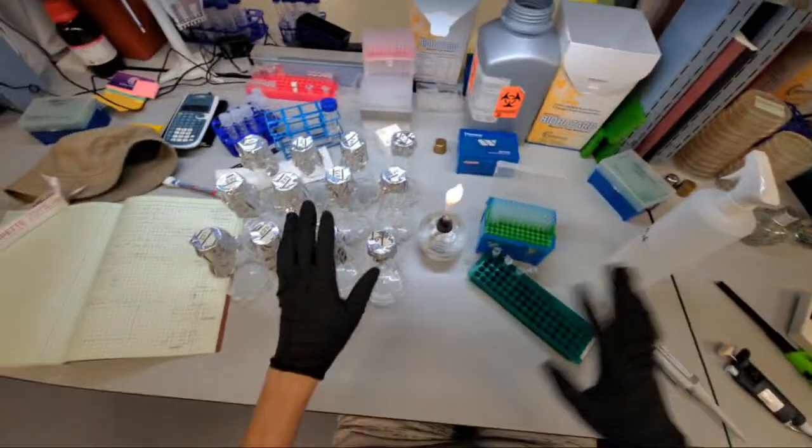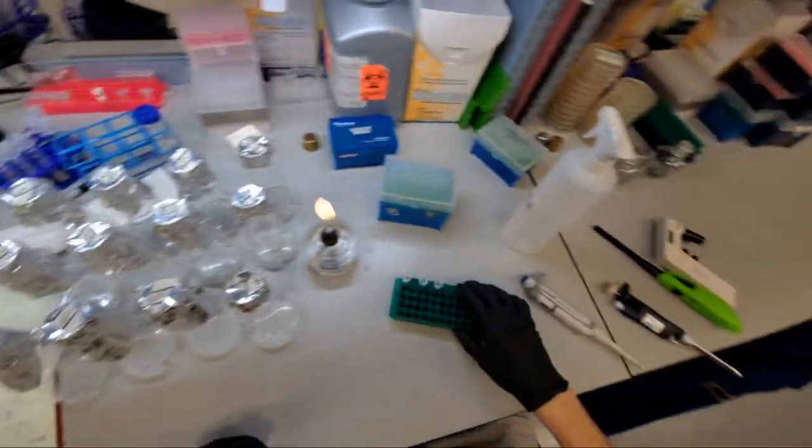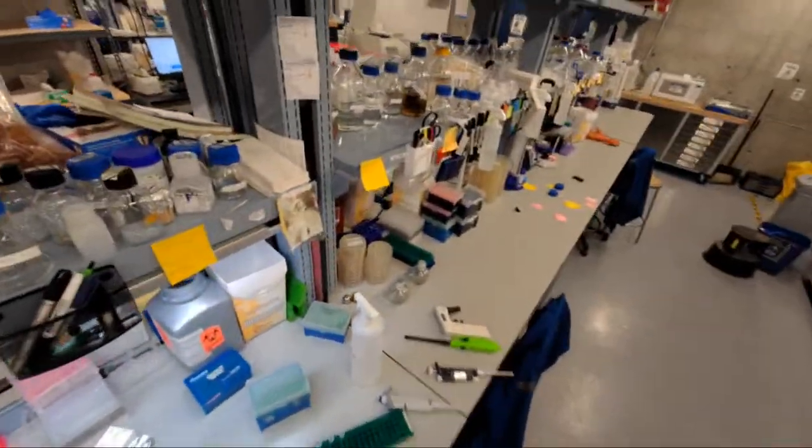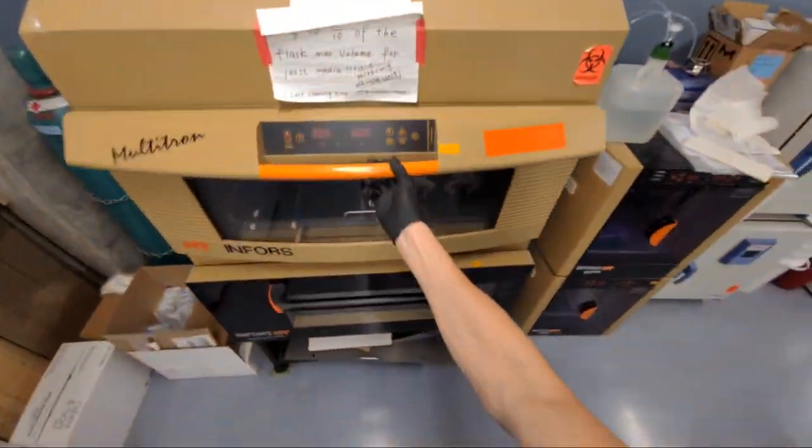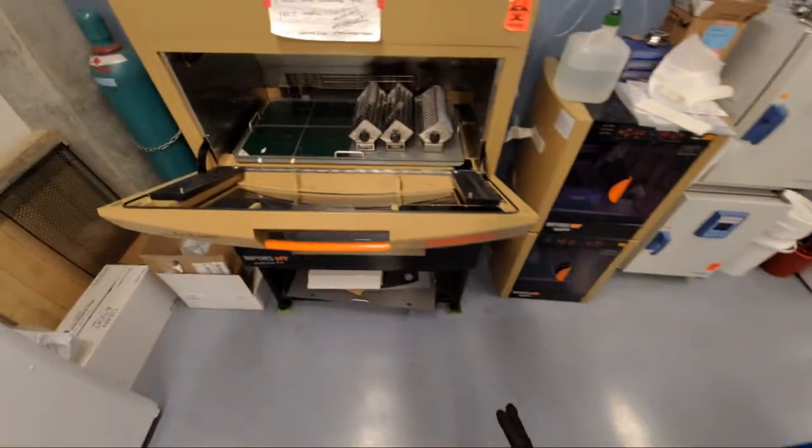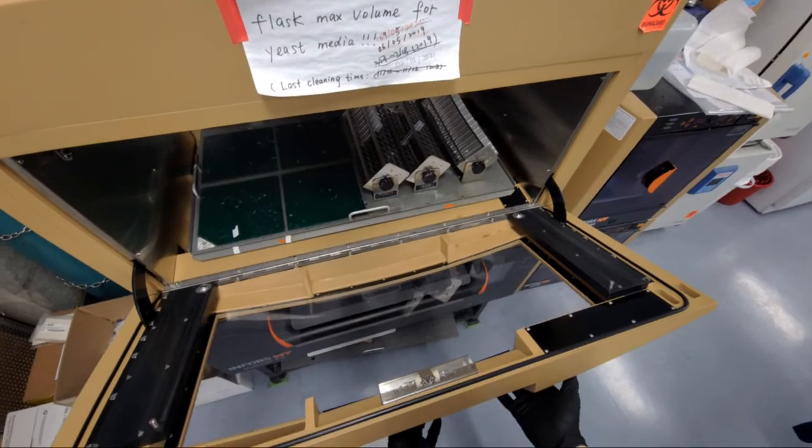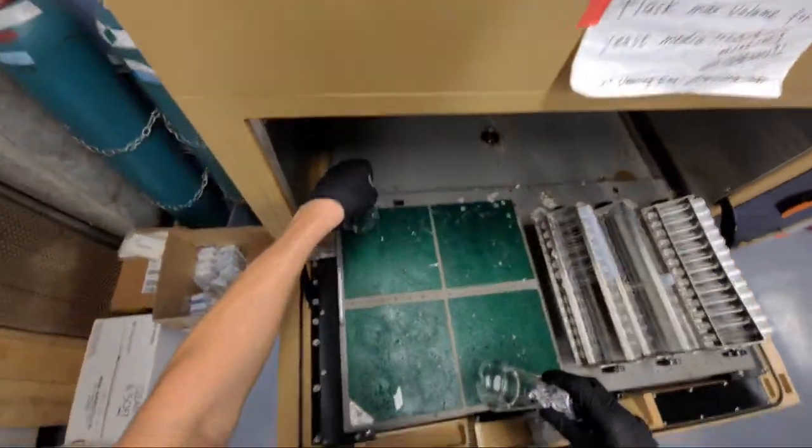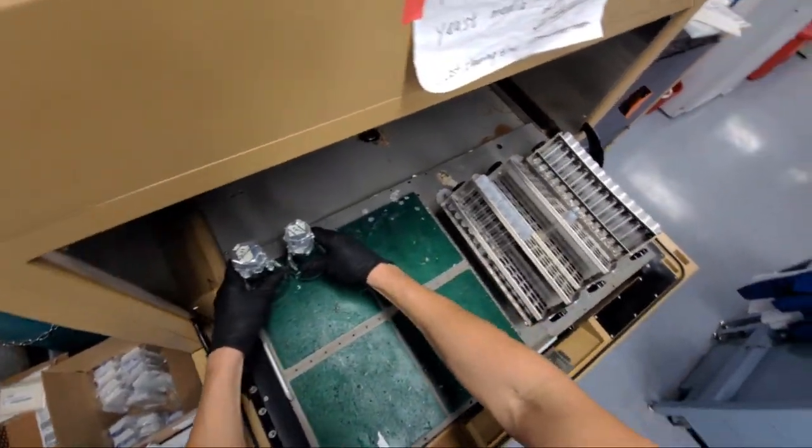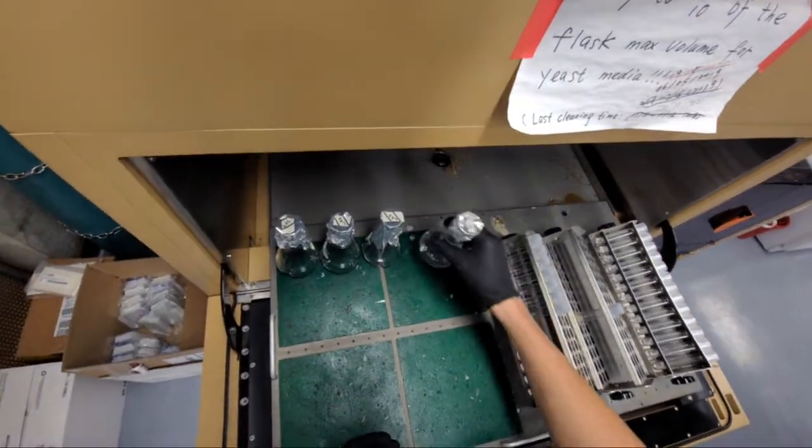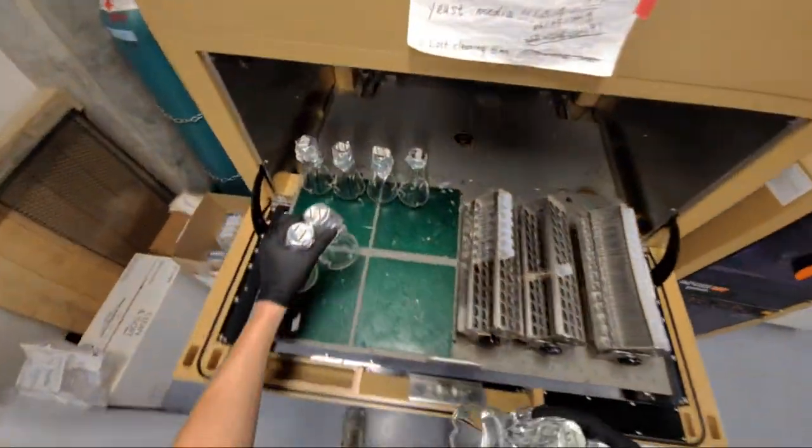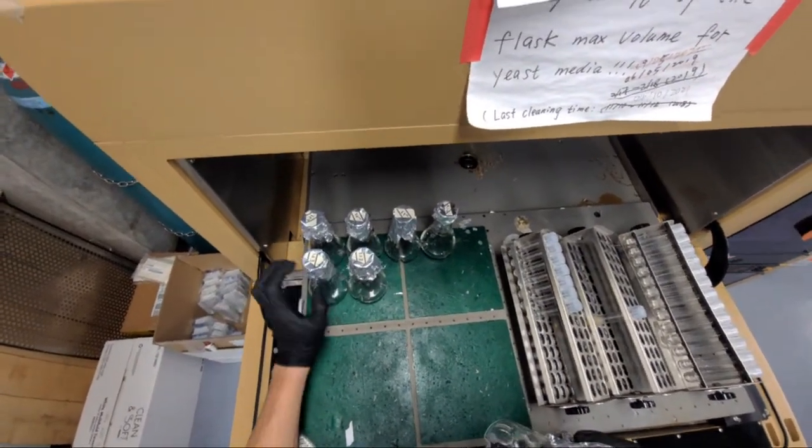I think with this and being consistent with microbial stuff, it doesn't really matter too much what your technique is. I think what matters more is the consistency of your technique, but it is a little after three, which is, it's five minutes after three, which is perfect. I wanted to start these at 3 p.m., but this will be fine. So this is our pizza oven style shaker incubator. So this pulls all the way out, so we have easy access. And these are sticky mats. They're really dirty right now. So these usually just set down, and when you need to take them out, you just pull them right off. If they get wet, they get less sticky, which is annoying, but it's not a problem most of the time.